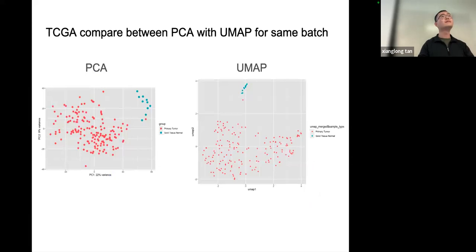It's able to pinpoint in more detail, so sometimes it's very sensitive. It could be, for example, if we change that nearest neighbor parameter to be too small, so that we focus on too fine a scale, we can still see some batch effect.